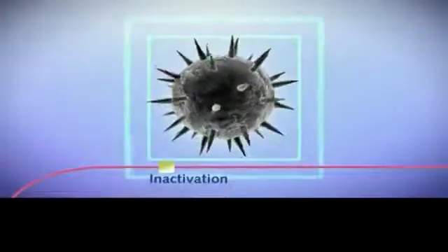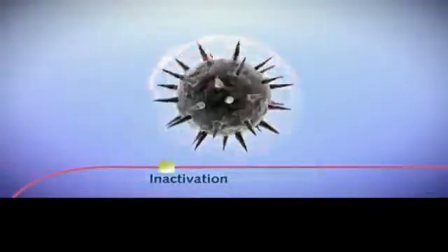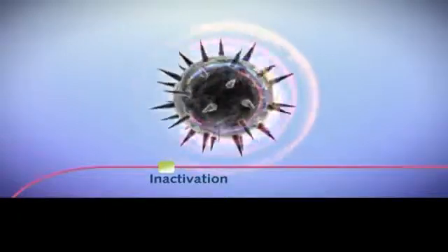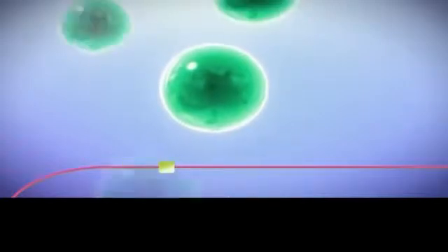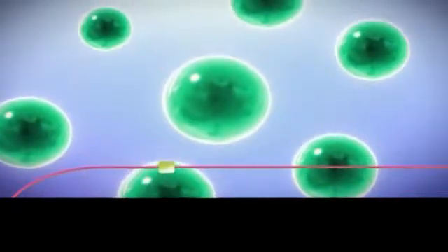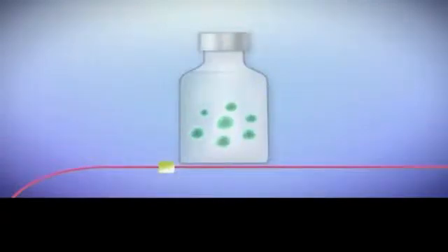Inactivation takes place next. This step is both extremely delicate and critical. Inactivation consists of destroying the pathogen's ability to cause disease while making sure they will still be able to induce an immune response. At the end of this phase, one obtains the very essence of any vaccine, its antigenic valence. And it's this valence that protects the body.